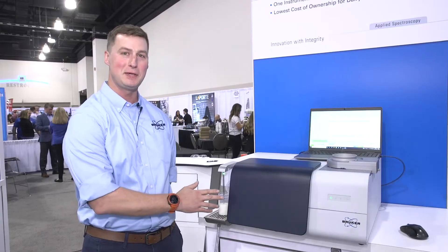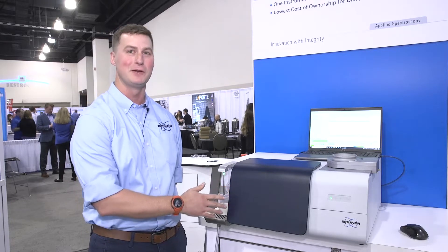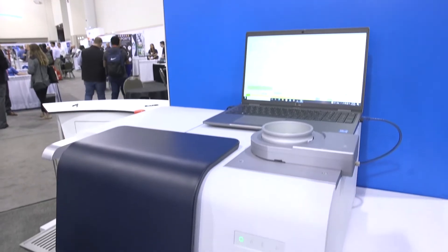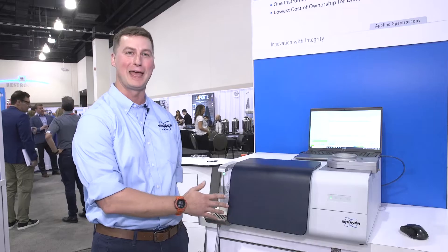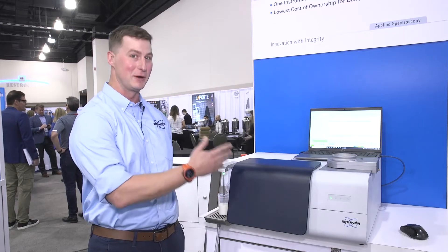This is our Bruker MPA2 dairy analyzer. The FTNIR technology we're using will eliminate instrument drift and therefore eliminate the need to bias adjust or recalibrate the instrument on a periodic basis. With our MPA2 dairy, we're able to analyze both liquids and solid samples on the same instrument with the same software.